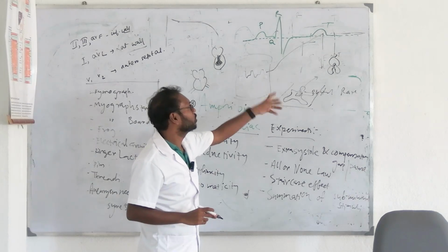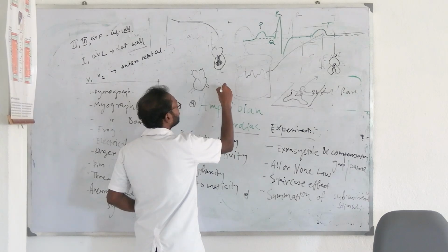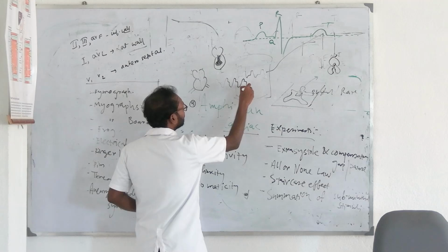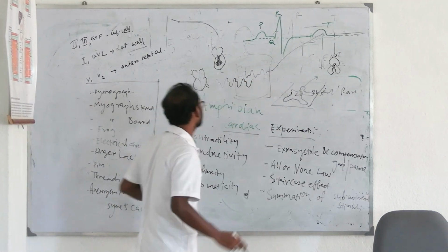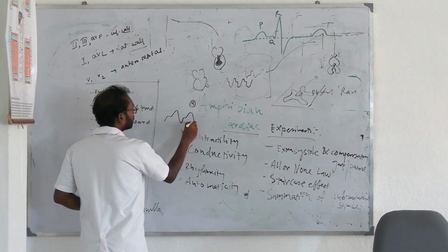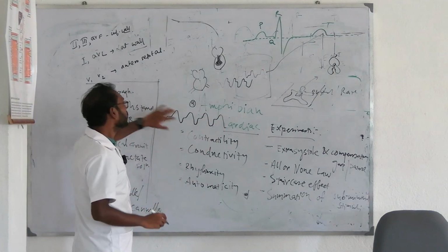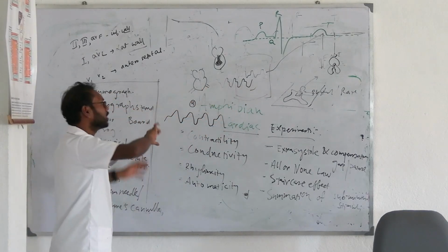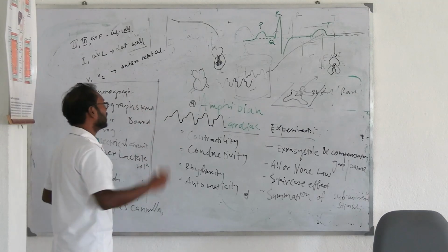since the heart is upside down, here it doesn't come exactly like this, it comes like this, okay? The picture is like this. The graph forms upside down like this, but the actual cardiac graph of a frog looks like this. Okay, what does it look like? Like this. Okay? Now when we look at the paper, it looks upside down like this, because the heart is upside down. Now when we want to see the values, we will flip it and look, then it will come like this.